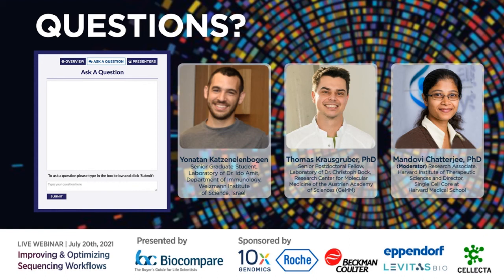What do you mean? For example, I personally prefer using a broader marker compared to using a very stringent sorting population, because my worry is that while choosing multiple markers for one single rare population, you might lose a lot of cells which might be relevant. Yeah, I agree. You better be broader than narrower.